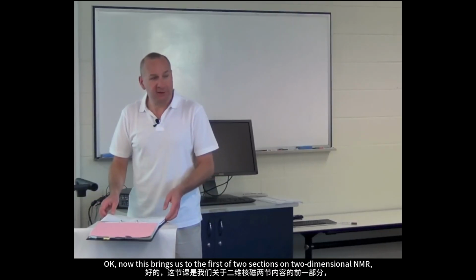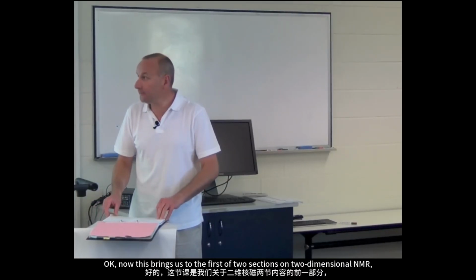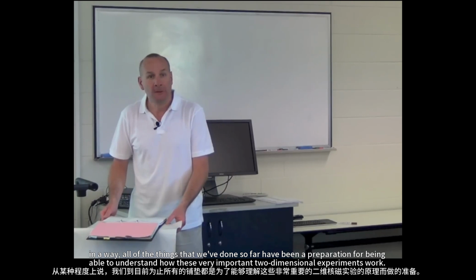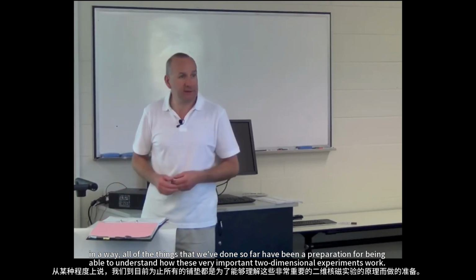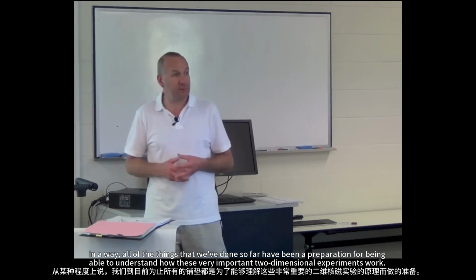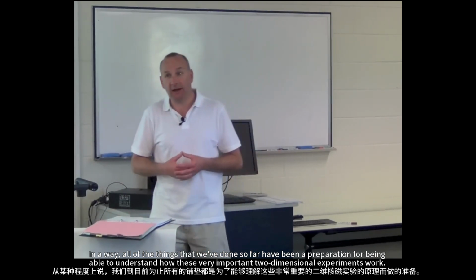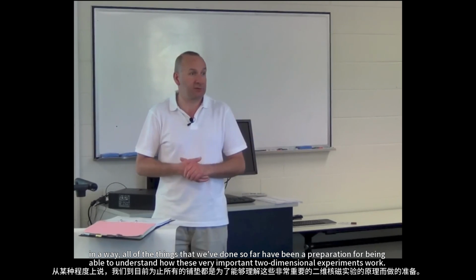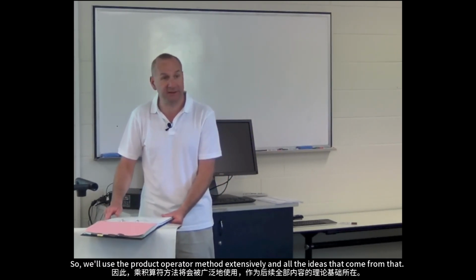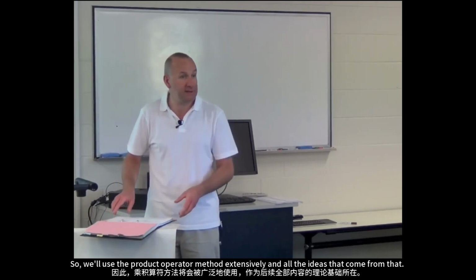Okay, now this brings us to the first of two sections on two-dimensional NMR. And in a way, all of the things that we've done so far have been a preparation for being able to understand how these very important two-dimensional experiments work. So we'll use the product operator method extensively and all the ideas that come from that.